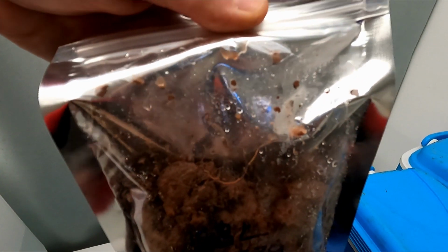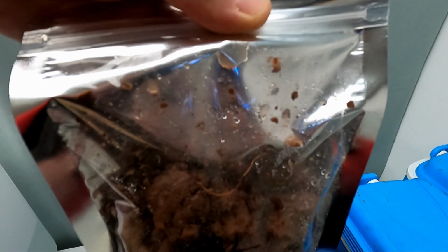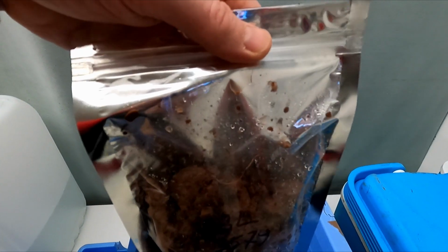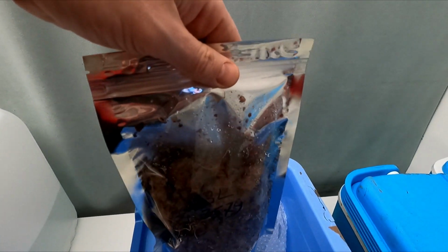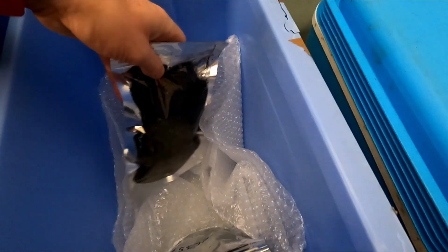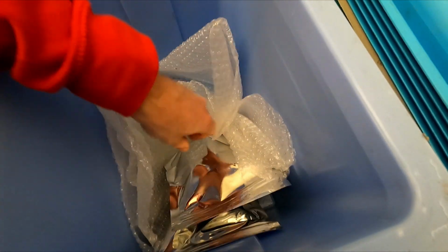You will also see I've actually taken this sample from the fridge. It's condensed already, and that's to do with the temperature change. So this illustrates precisely why you need some form of temperature control, just to slow down the microbial activity in your bag of soil once you've taken it from the ground. So we're just going to put that bag in there. We will add another bag. There's no rocket science to this. I'll put the others in and then show you what it looks like.